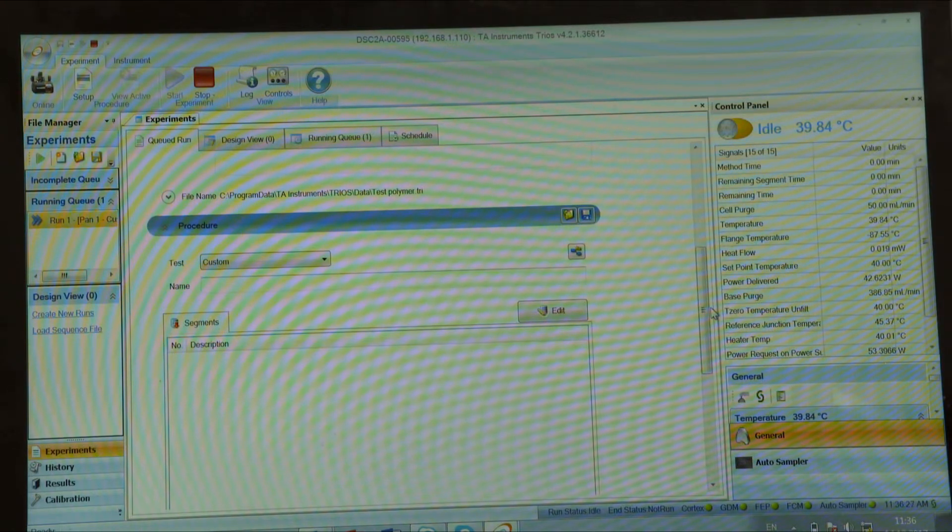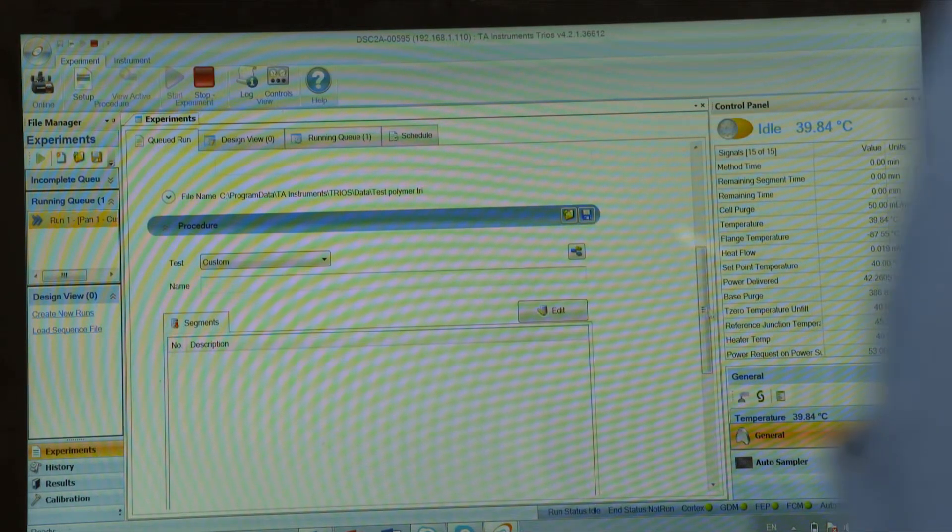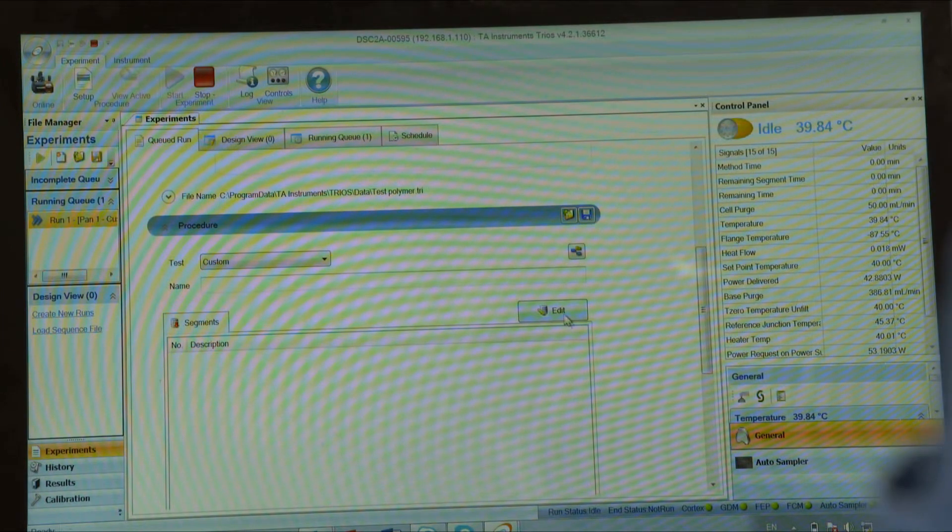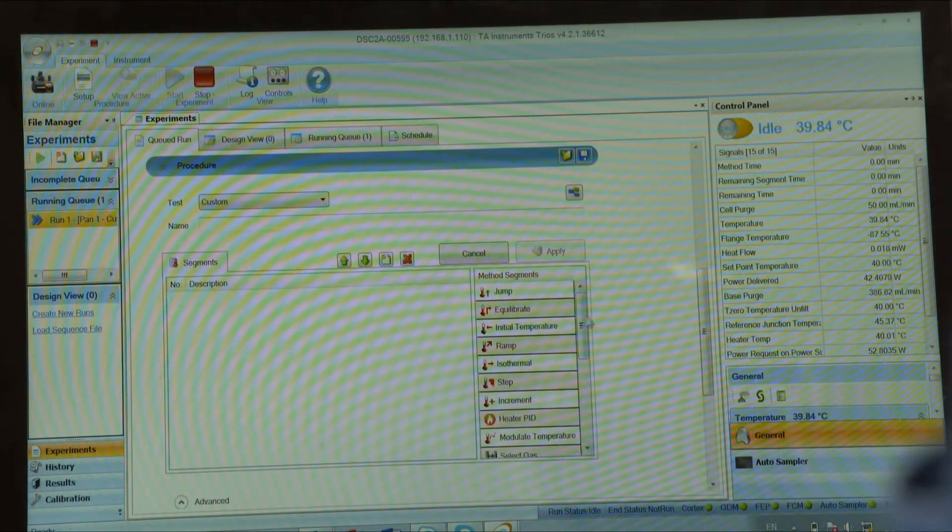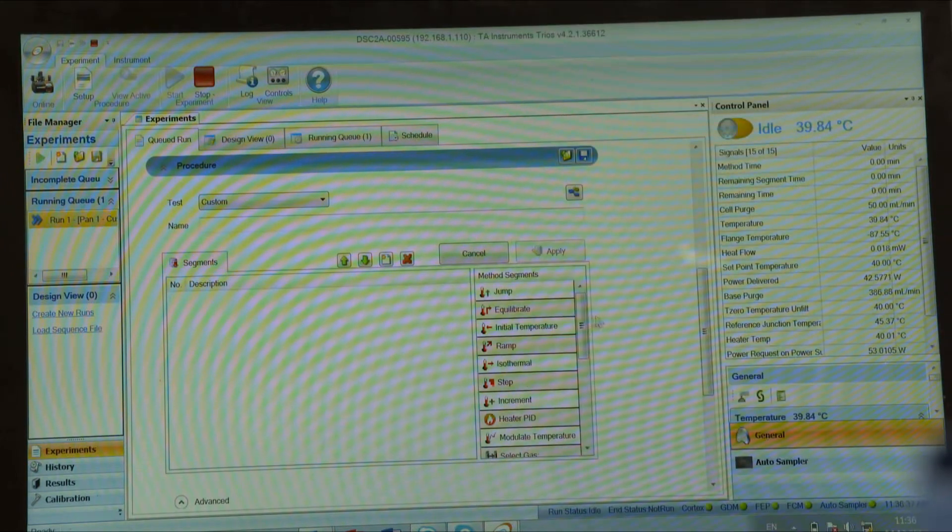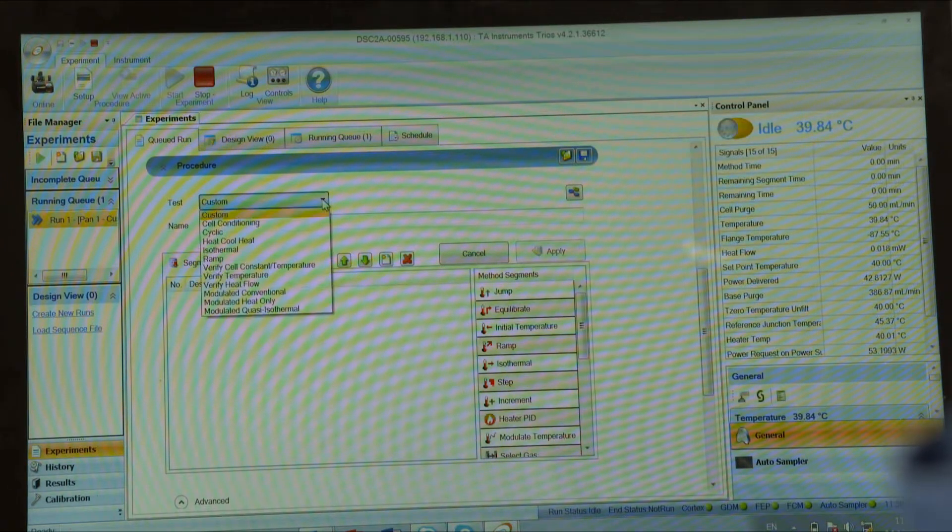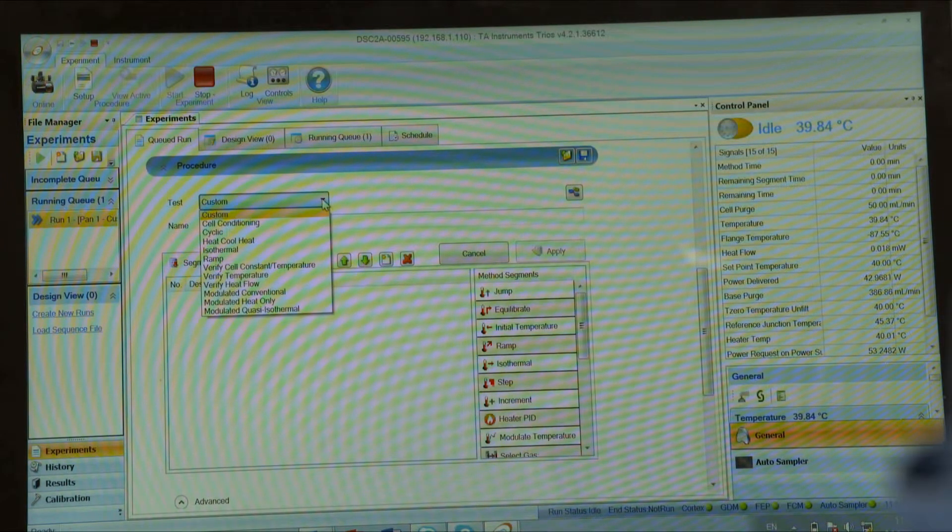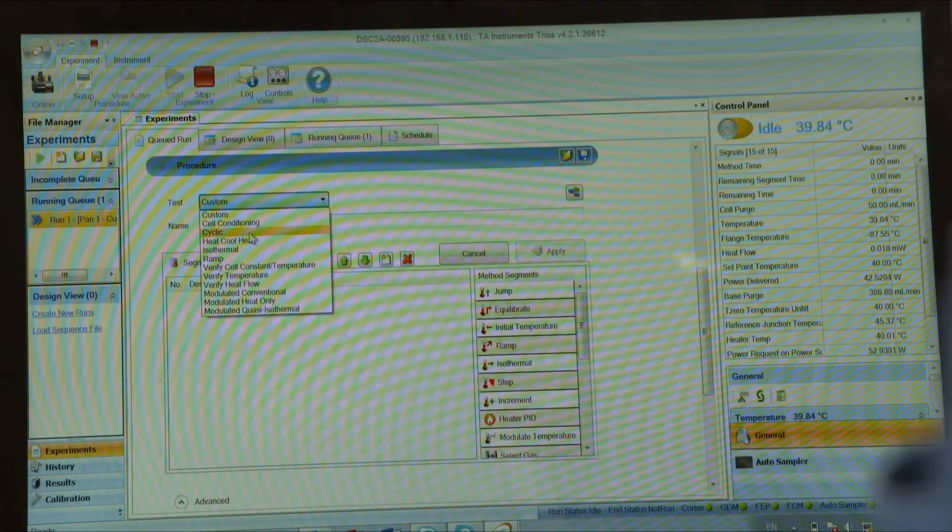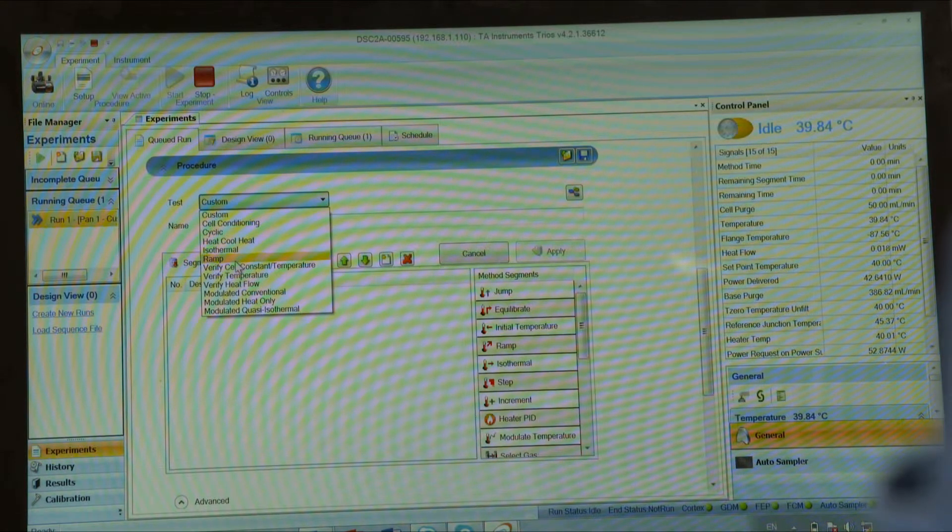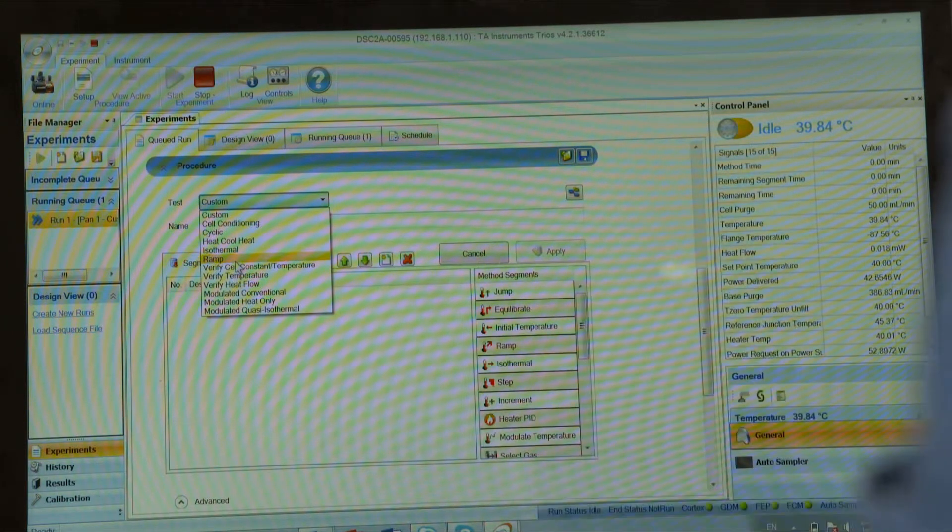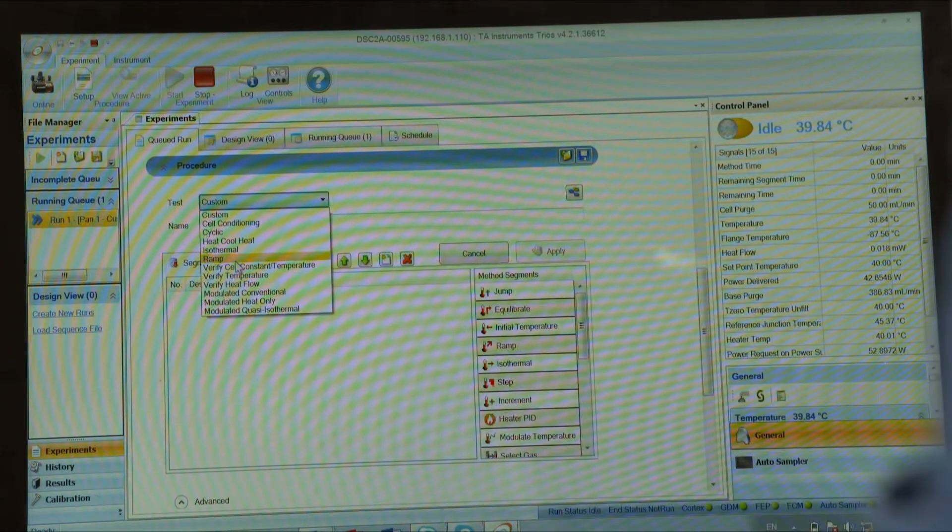And then you have to create a procedure. You can choose a custom-made procedure. In this case, you would have an editor with a set of segments, or you can create just a simple ramp procedure.